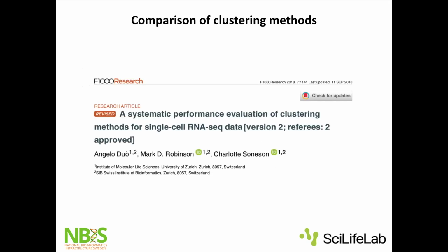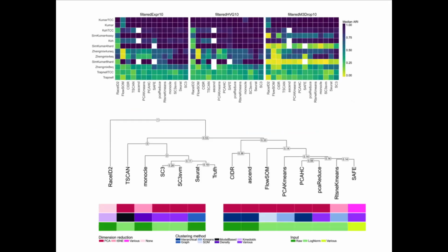So there have been a few benchmarks of different clustering methods. I'm actually jumping back to a very old comparison here. That was before everyone came to the conclusion that we should do graph clustering. So they basically have here the true clusters with their different methods versus the clusters they end up with in all these different methods.